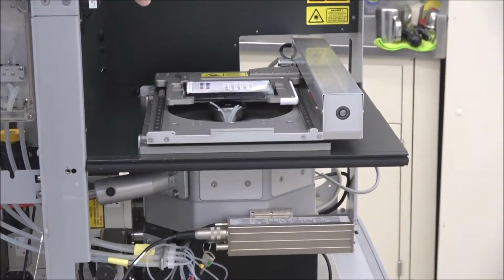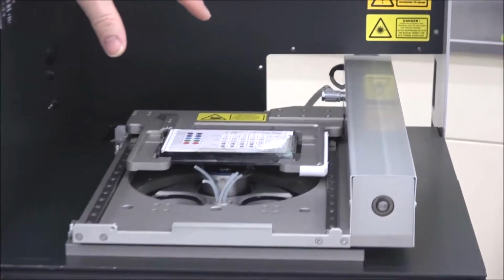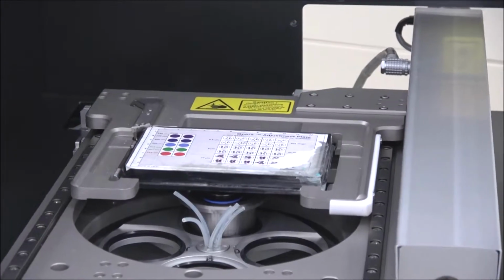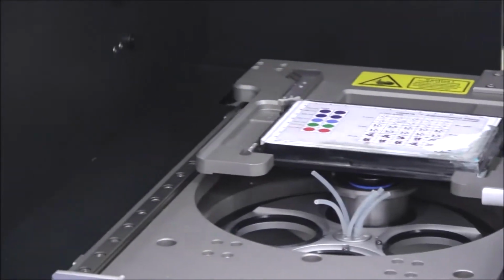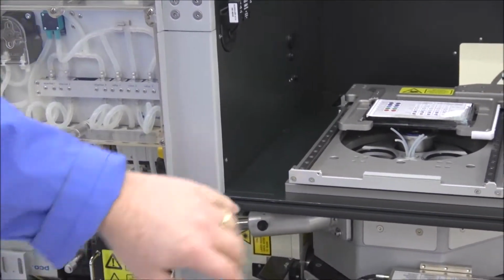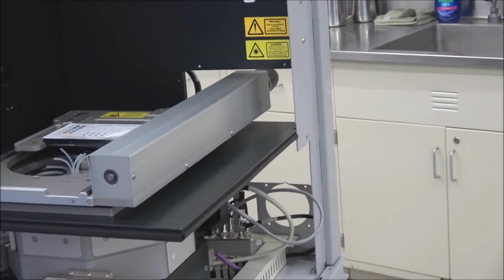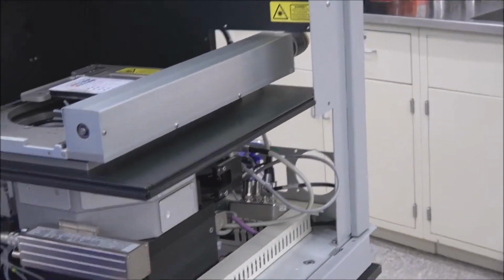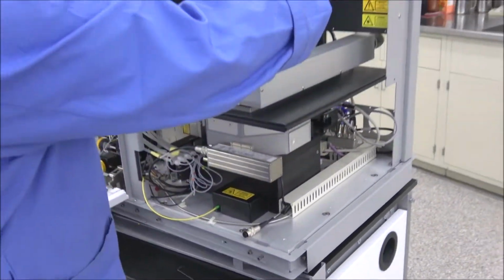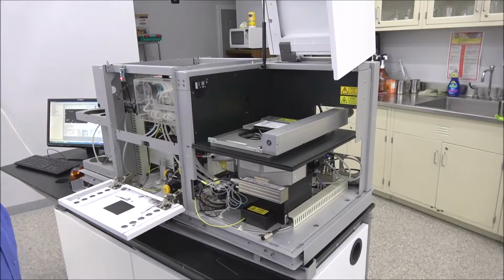Also, you can see I've got my Opera adjustment plate in here ready to go because I want to show you a little bit there. I'm just using an air lens here. But if you lift up the lid, there's a bolt here, and then there's one around on this corner over here too. And then again down here, there's a couple that you can just loosen, and then the whole side corner will just pull right out of there, and that'll open up this whole thing here.